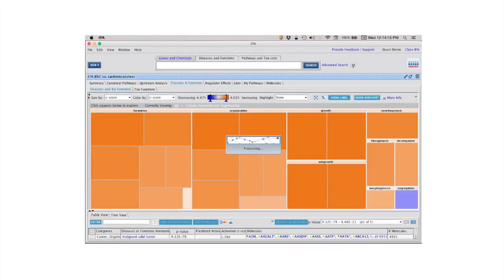When you filter the differentially expressed genes, why do you use FPKM, not the original number of mapped reads to the gene? Yeah, I just felt it better to use the normalized, normalized by length of the gene. You can do it either way. I mean, this is not rock solid, you have to do it this way or it's wrong kind of thing. It's just the way we did it.